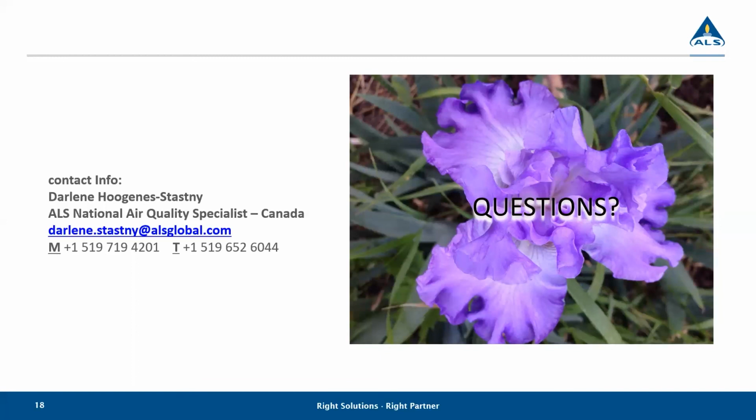Okay, another question from Rui. What is a reasonable pressure difference between field end pressure and the pressure when received by the lab?